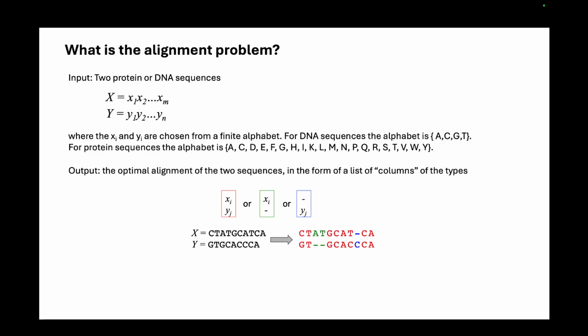Now we have done all kinds of processing and quality control. Now you want to do the final steps of this analysis. First comes the alignment problem. You need to align the read information that you have to a reference genome.